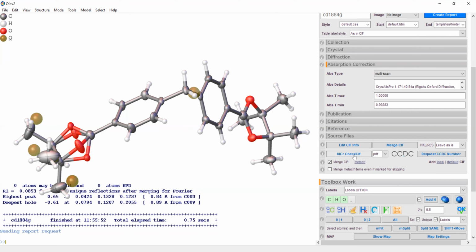So I'm just waiting for the checkCIF report. Taking its time.